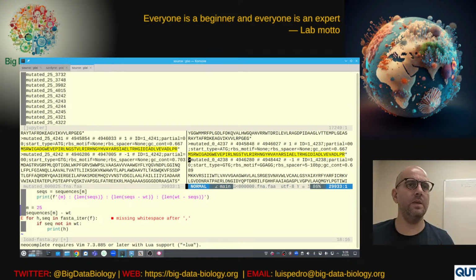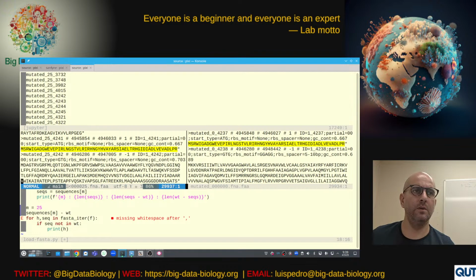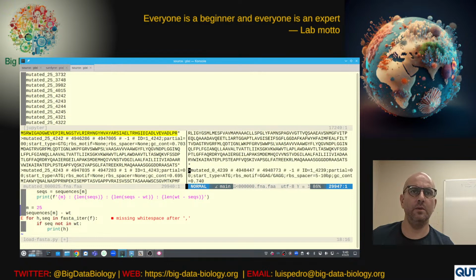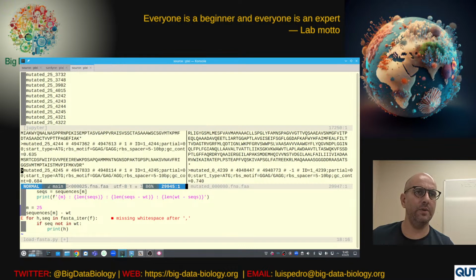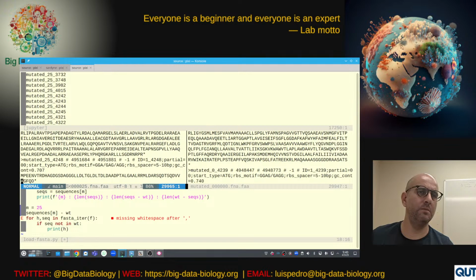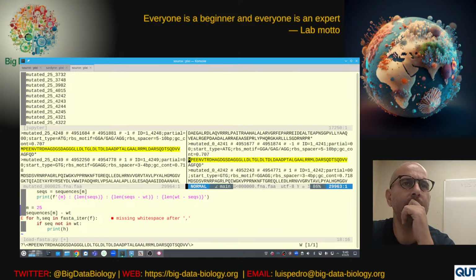And then that was a mutation, and then it's completely messed up, that one. Oh yeah, there's a very nice long gene there that just gets broken up into a bunch of little ones. And then it regains, it's correct again.